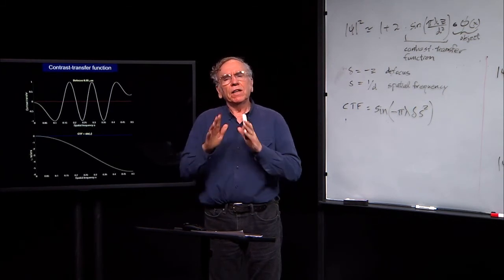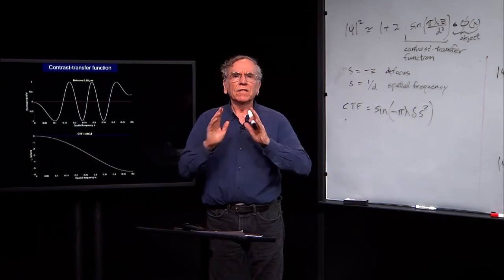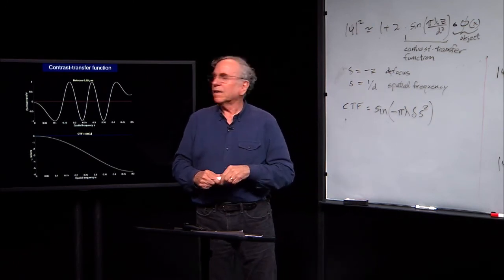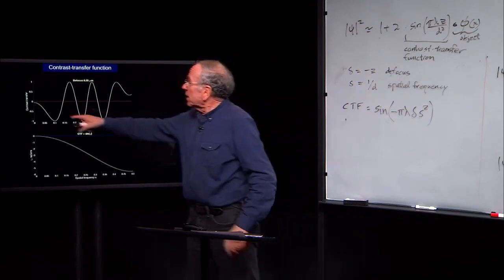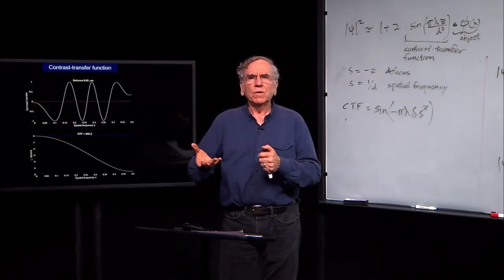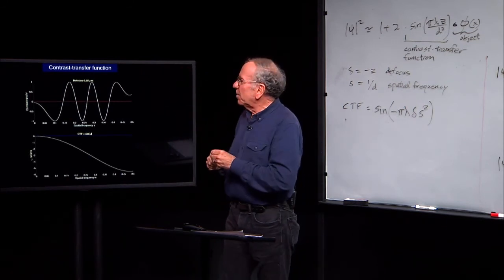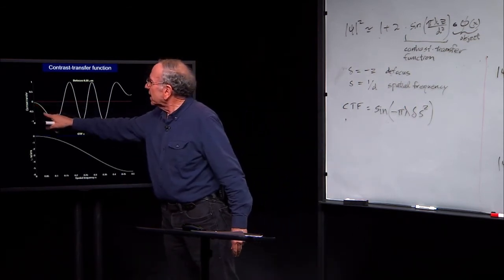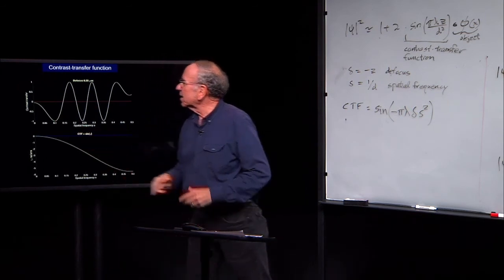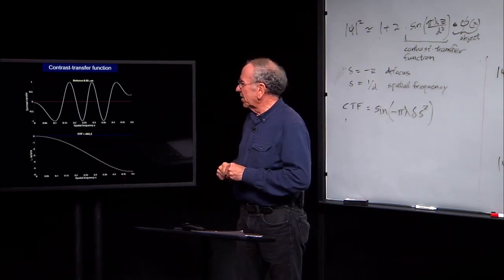It's amplitude contrast, and it's due to electrons being scattered through high angles so that they're caught by the objective aperture. So there's a little bit of negative contrast. So there's an advantage to focusing above the specimen because we have this whole entire increase in contrast be in the same direction, in the direction of negative contrast.